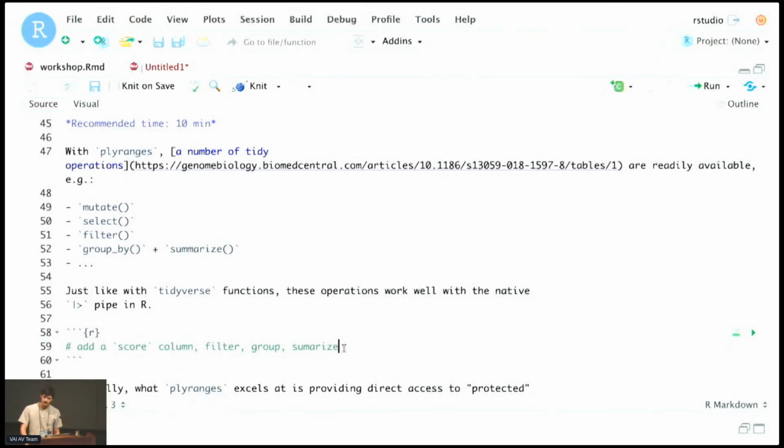I see. So the benefit is basically that you do the same thing, but you could insert additional tidyverse steps in between. Exactly. And then we'll see just now that once you coerce it as a genomic ranges object, you can still use the tidyverse operations to manipulate this genomic ranges object. So essentially, it doesn't make much difference. For the importing step, it just didn't follow the natural process of the tidyverse workflow.